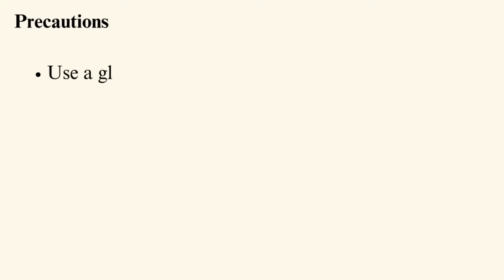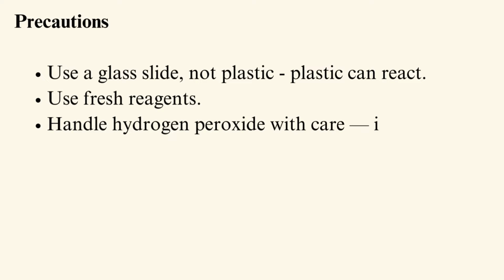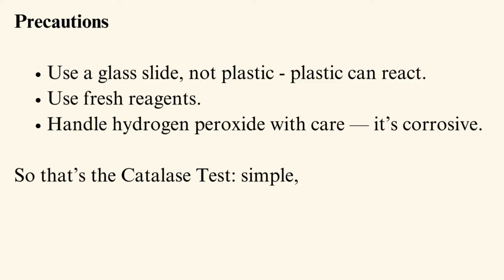Precautions: use a glass slide, not plastic. Plastic can react. Use fresh reagents. Handle hydrogen peroxide with care, it's corrosive. So that's the Catalase test: simple, fast, and crucial in pharma microbiology.